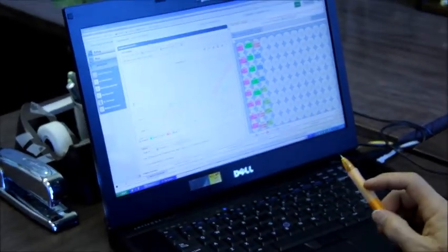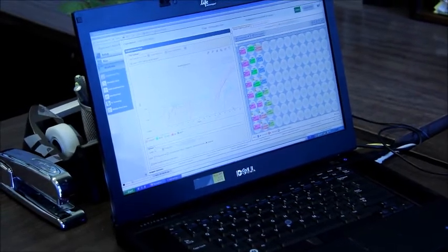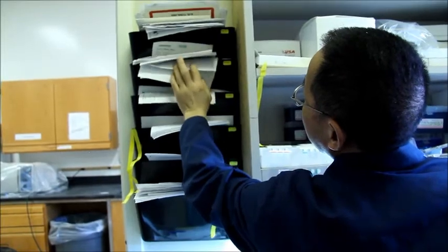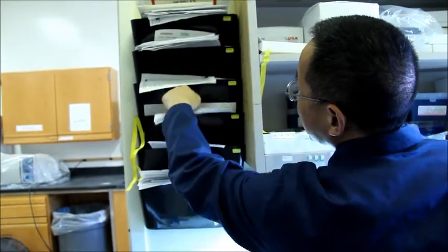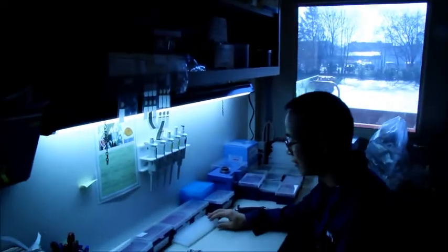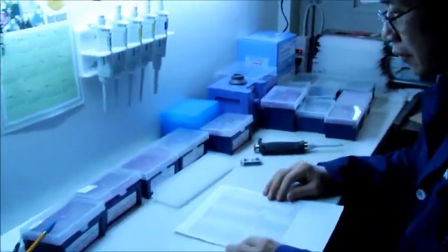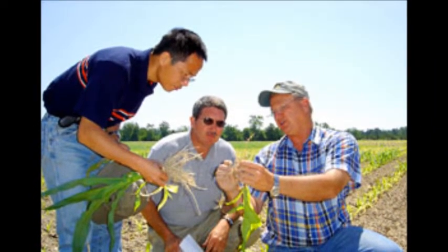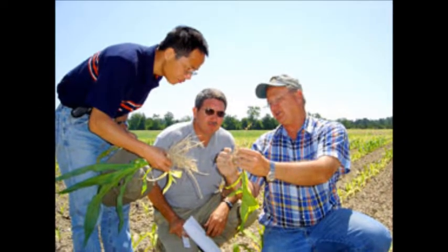On our report, we will identify the nematode species, count the population level, determine the hazard index, and give a site-specific recommendation to manage the problem. The nematode control includes chemical treatment, using resistant varieties, or rotation. So growers or citizens can take a lot of approaches to control the nematodes.